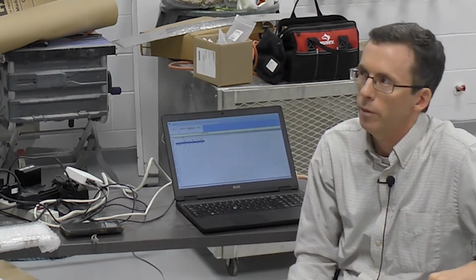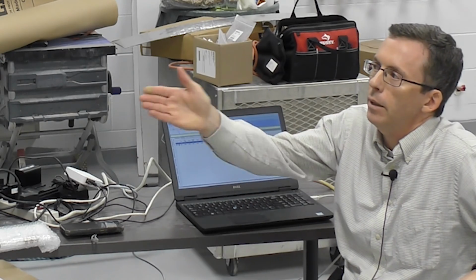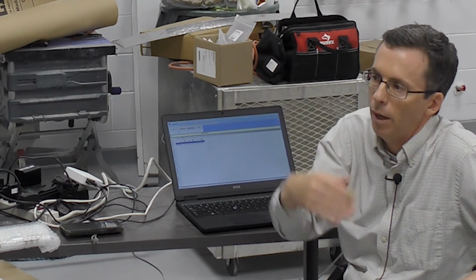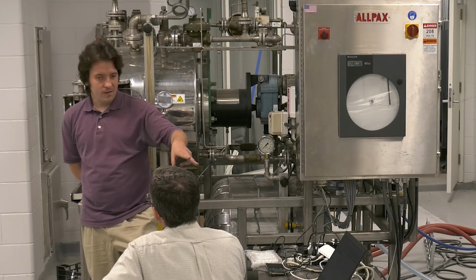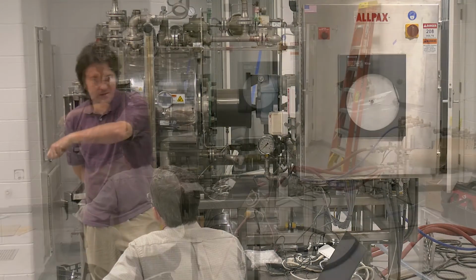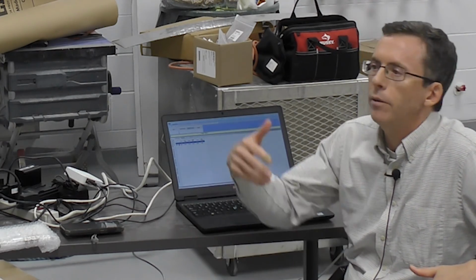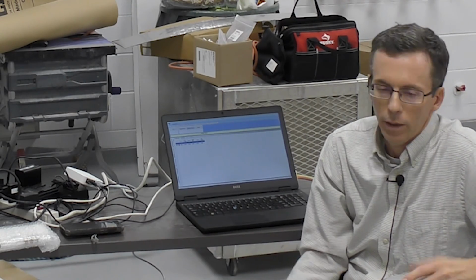But you're right, for research, it's not a big deal. I mean, that's true. Okay. You're right. But I try to do it exactly when you're starting so that the analysis doesn't have any padded time at the front. I was just thinking, but I mean, we're using the same computer for both in this case. So you have to start one and start the other. Oh, so in that case, start this first? Yeah. But I wouldn't start it 5 minutes in advance. Just start it, and then within 30 seconds, get the retort started. Okay. That's fine. Cool. Does that make sense?